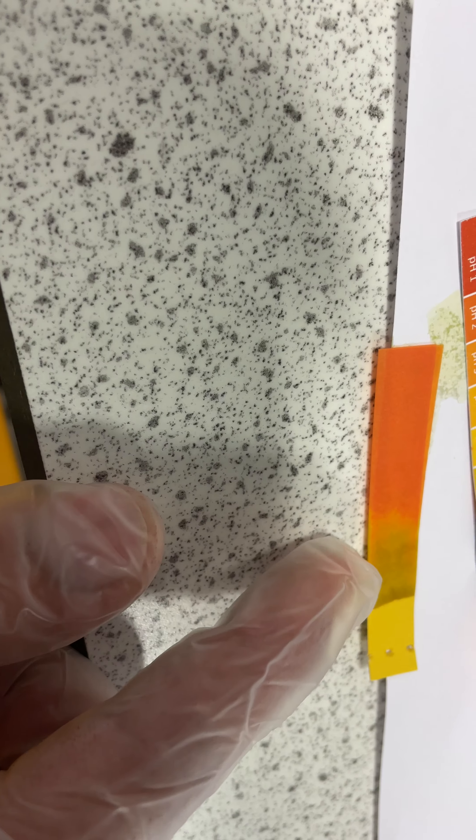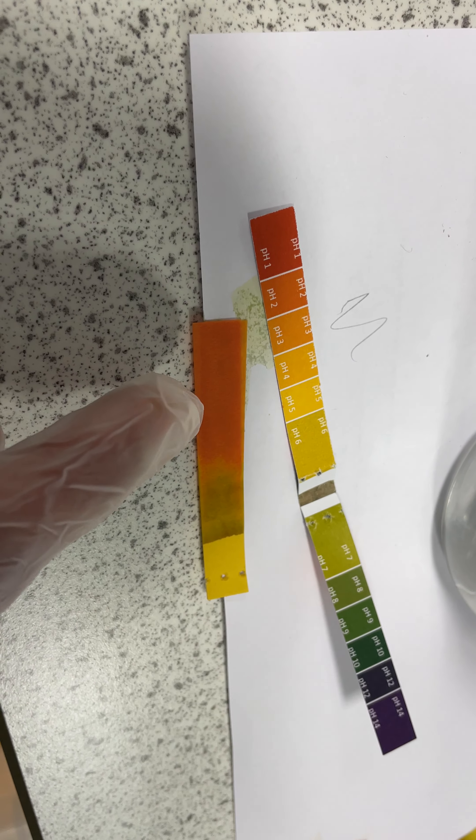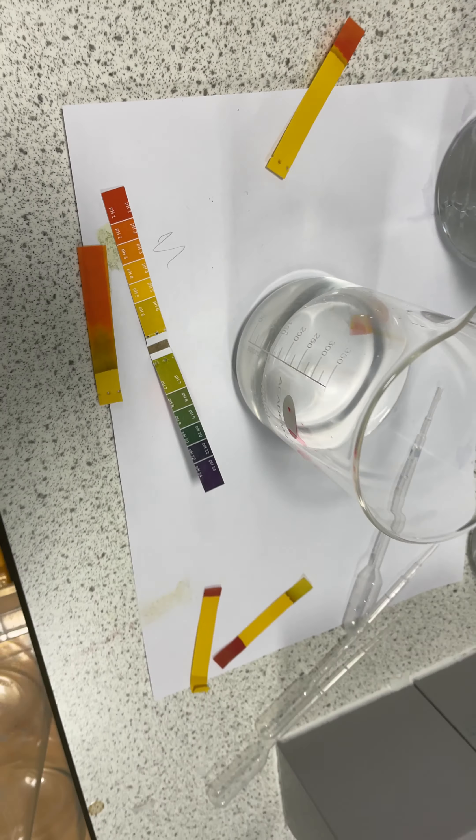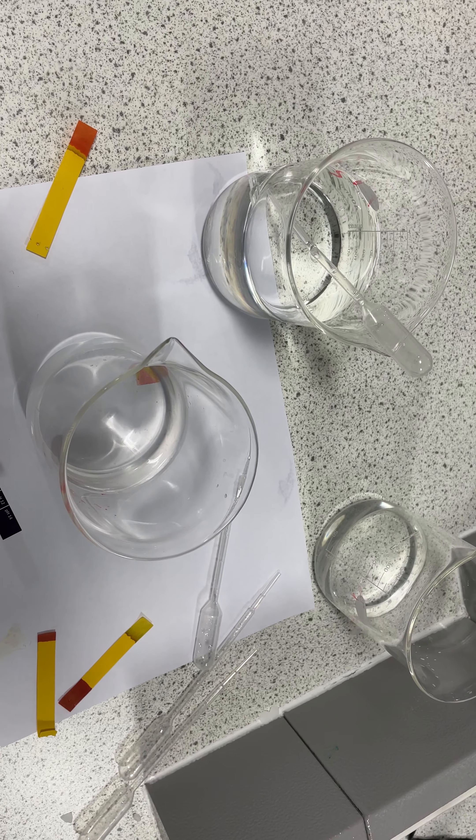However, if I keep adding water to this, essentially diluting the acid and reducing the concentration of hydrogen ions — three mil, four mil, five mil — that should take it closer to this end of the scale. Water is obviously pH7, so a fresh bit of paper placed in there, and instead of bright red we're now getting an orange — so pH two or three. If I keep adding water, I'd say about 75 to 100 mil added.